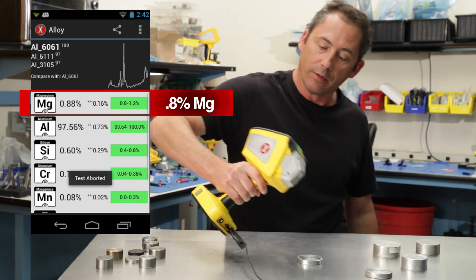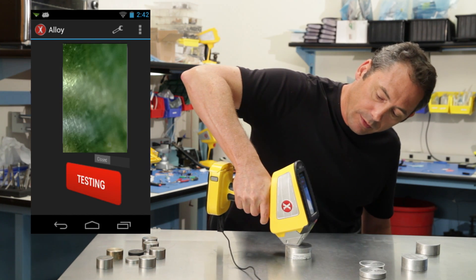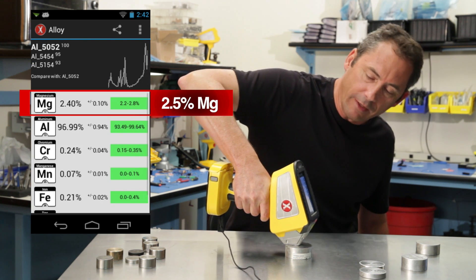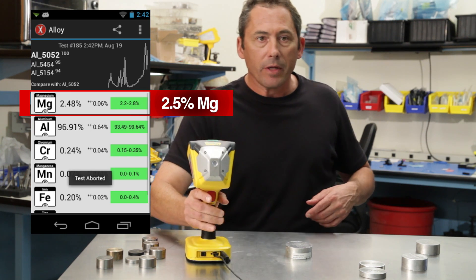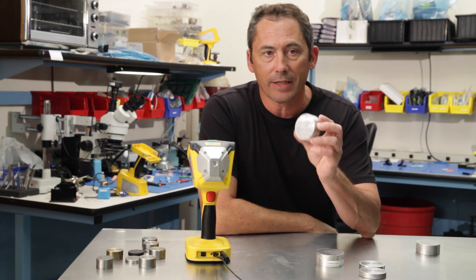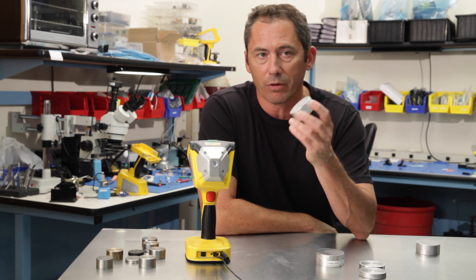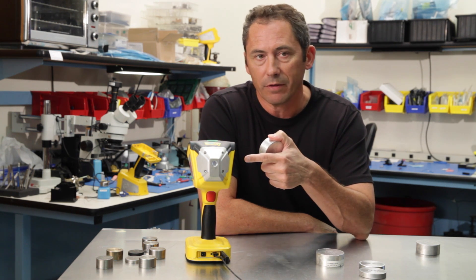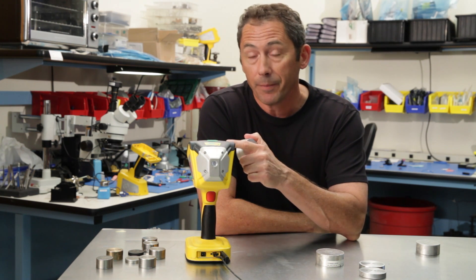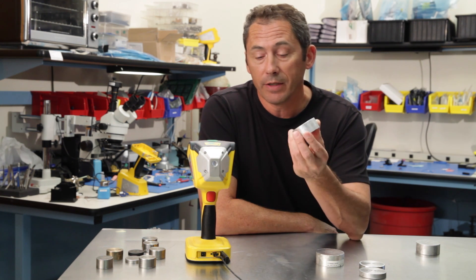There you go, done — there's your 6061. Here's a 5052: this will be even faster because it's a couple percent magnesium. There's beam two — done — two and a half percent or so. How does the test time compare? Other X-rays take anywhere from 30 to 60 seconds to do that, and we're doing it in less than ten. So we're three to six times faster depending on who you're comparing to, because this device can run at much higher count rates with much better resolution. It uses a new rhodium-anode type X-ray tube that achieves very high currents.